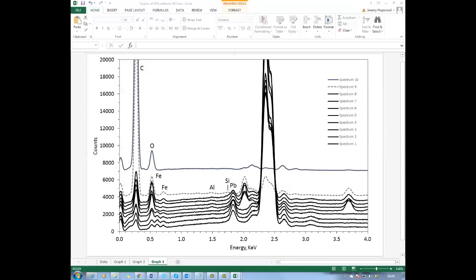So this is the one we're most interested in, because we're interested in where is phosphorus, where is it on the lead mineral scale. So you can see in the spectra 1, 2, 3 and 4 it's not there, but then at 5, 6, 7, 8, 9 there's a lot of phosphorus. And then this one here on the resin, obviously there's not much phosphorus.